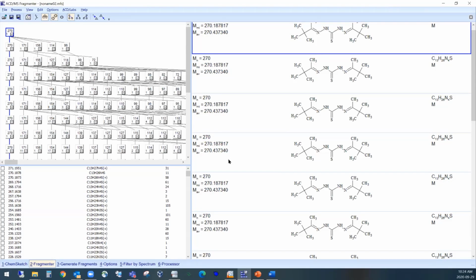Okay, so what it's doing now is comparing the generated list of ions that are present in the mass spectrum to what was generated here. And if there isn't a spectrum open, it will alert you and tell you to abort the search. Now it can take a little while to do this. As I said, it really depends on how you've chosen the molecule to be fragmented. And as I have chosen every possible permutation, it will just simply go through and break the molecule apart in every conceivable way. But some of these ions may not actually be observable in the mass spectrum itself.